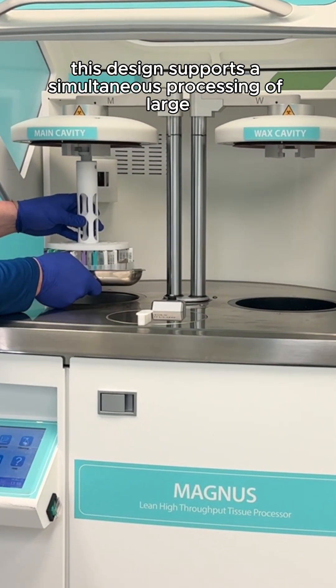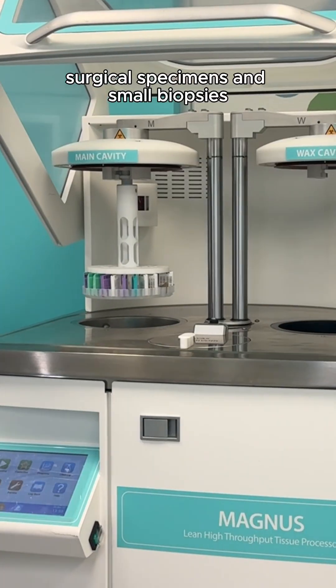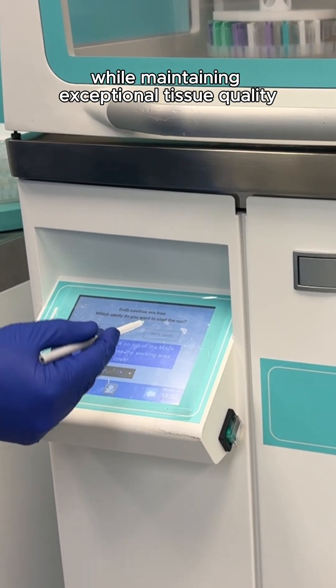This design supports simultaneous processing of large surgical specimens and small biopsies, making it ideal for flexible daytime or overnight workflows while maintaining exceptional tissue quality.